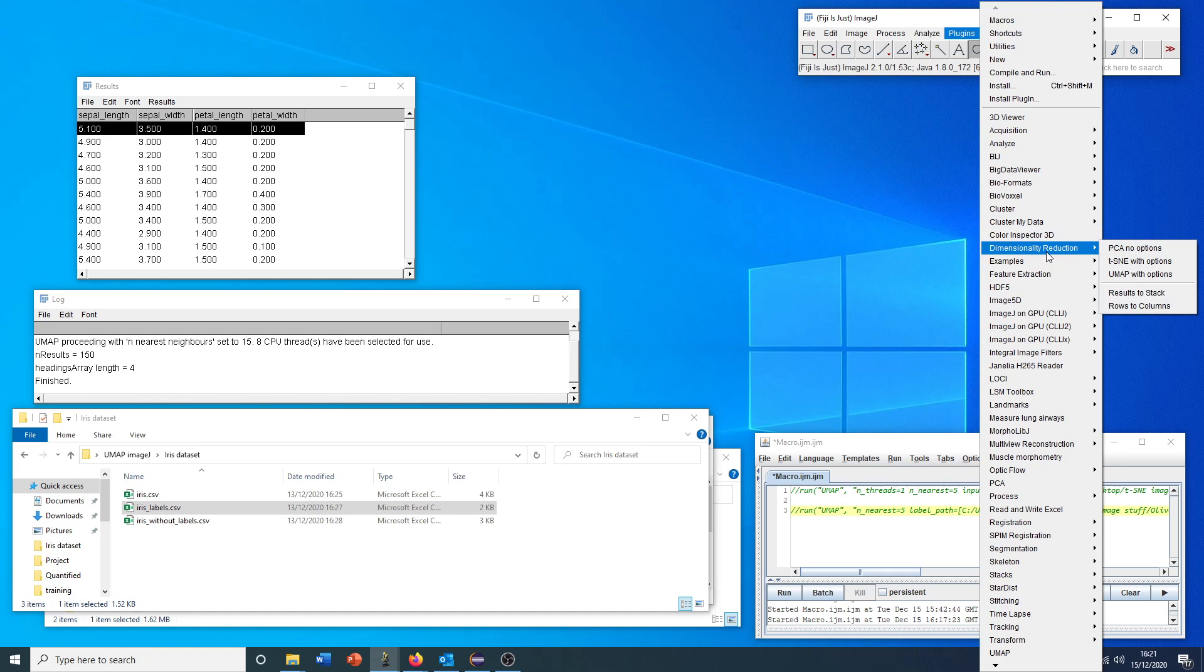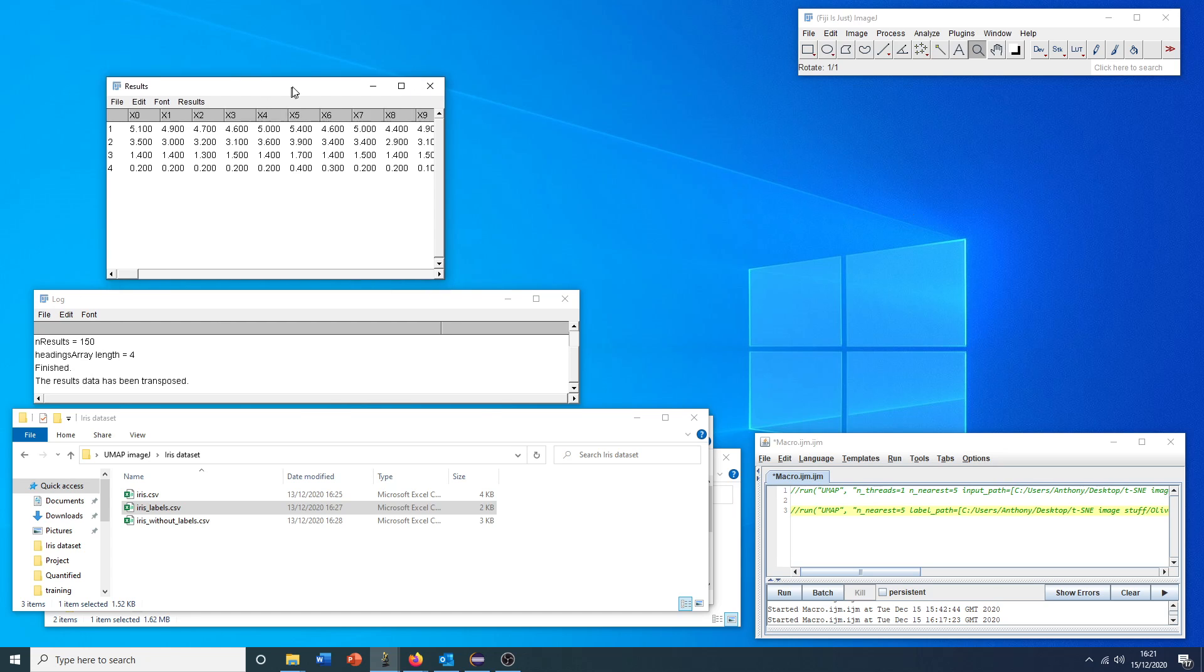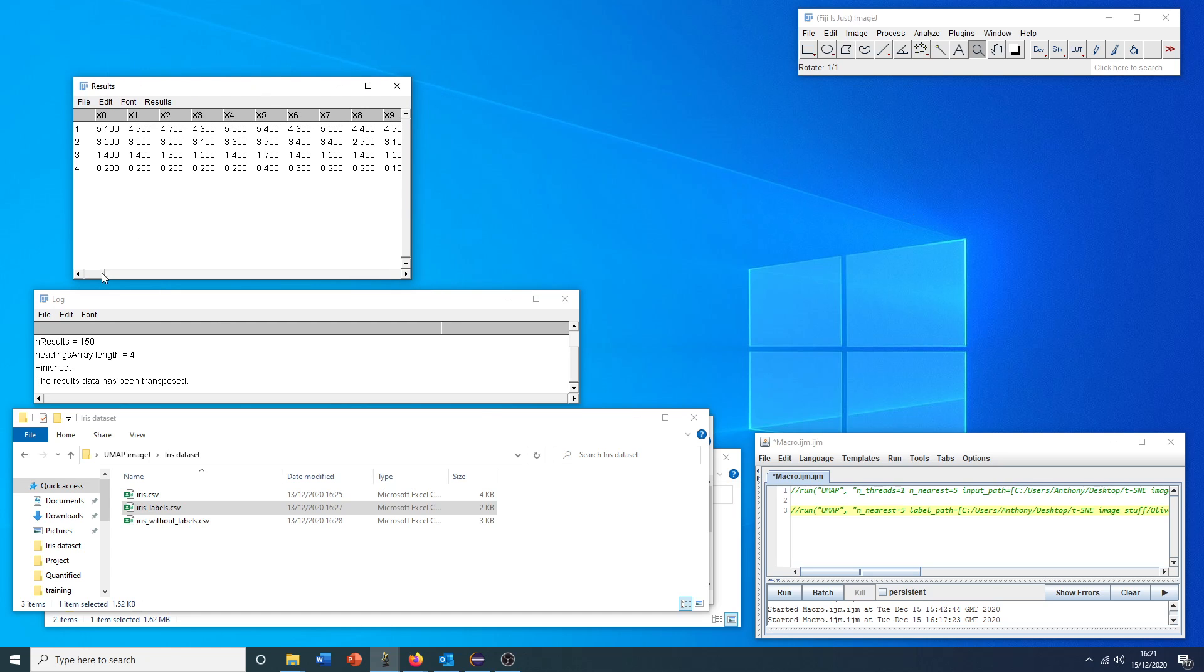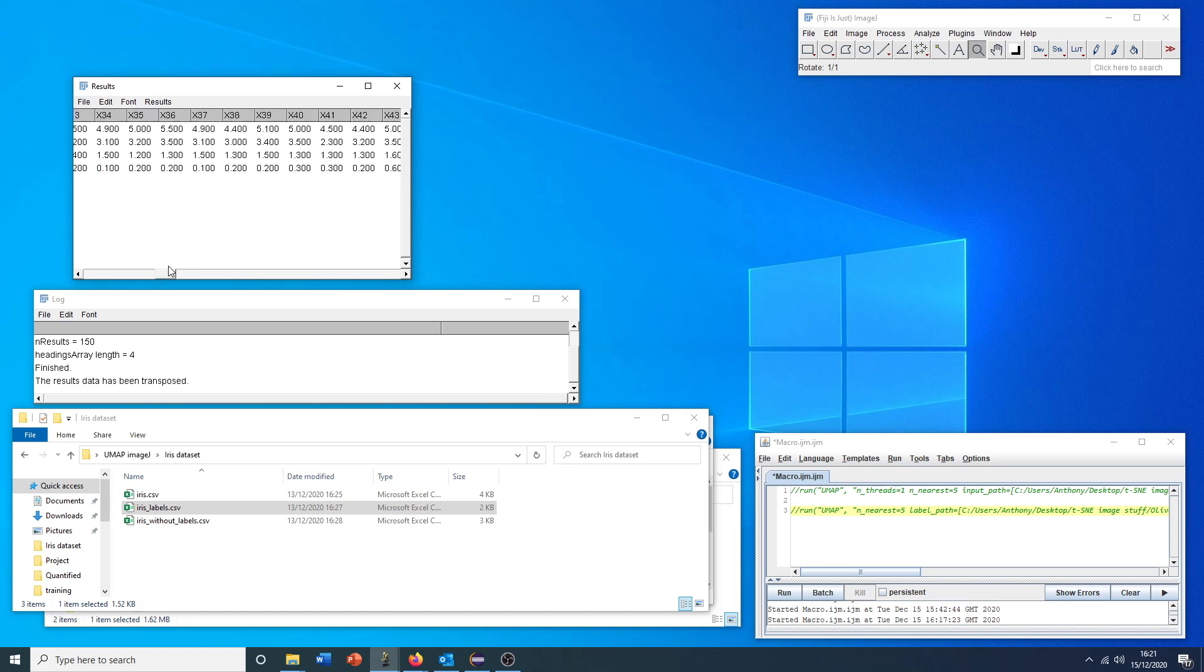If you go to dimensionality reduction, we can use rows to columns. And this very quickly has transposed our data now to have each individual instance as a separate column. And now our flower properties at different rows.